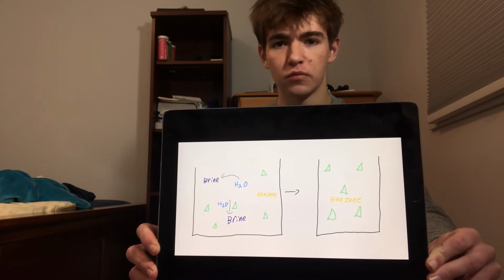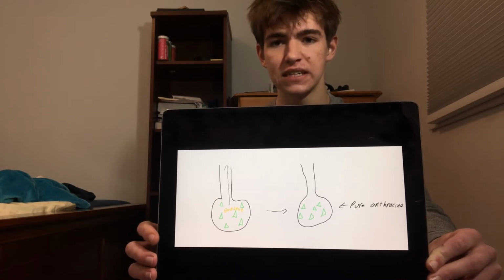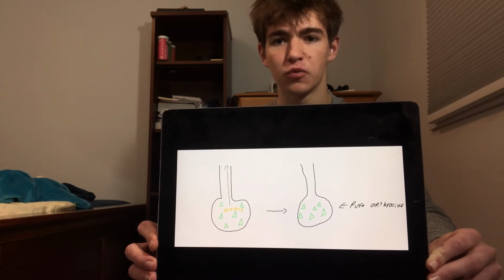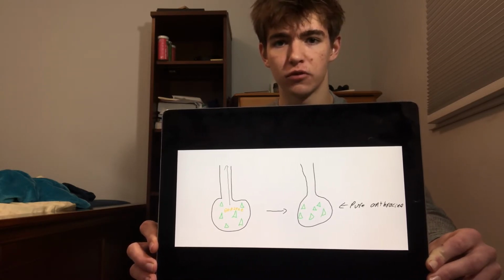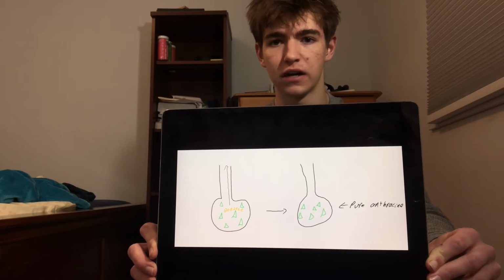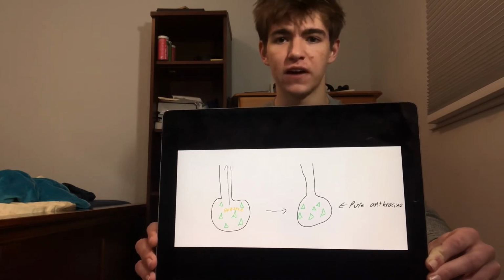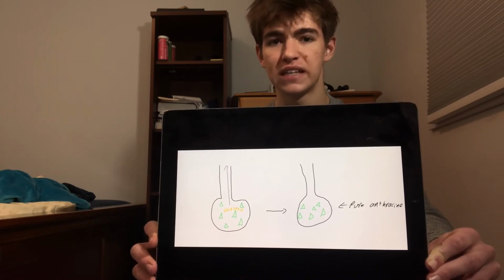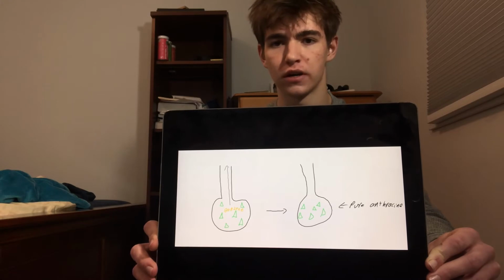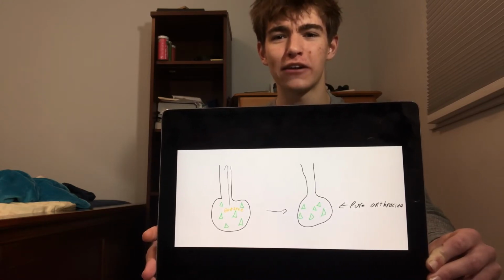Next, you want to go to the rotovap. Since the boiling point of benzene is 80 degrees Celsius, we'll be able to remove it via the rotovap. Beware, you'll have difficulties removing solvents that have a boiling point above 100 degrees Celsius. So, you want to put the solution in the rotovap, and in about 5 to 10 minutes, let's say, the benzene will evaporate out of the product, leaving your isolated anthracene. 2 out of 3 done.